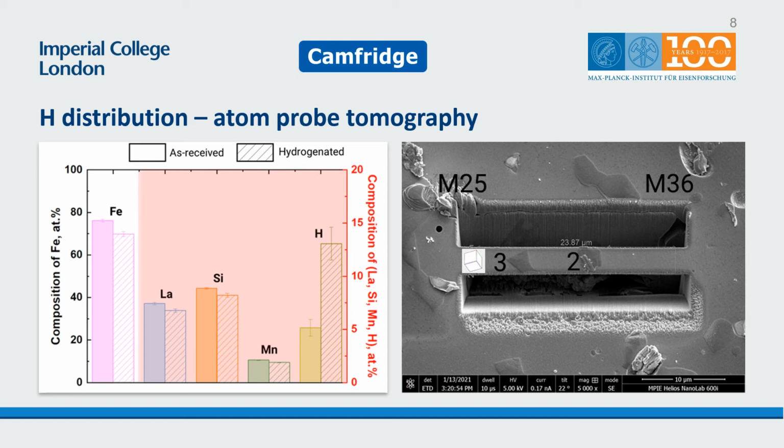which is good. And similar to the site-specific fabrication of micropillars based on the EBSD results, we lifted out atom probe needles with 111 and 001 planes parallel to the sample surface, thereby making use of the high spatial resolution of atom probe in the Z direction. And this is for us to study the hydrogen atom arrangement on these two sets of crystallographic planes.